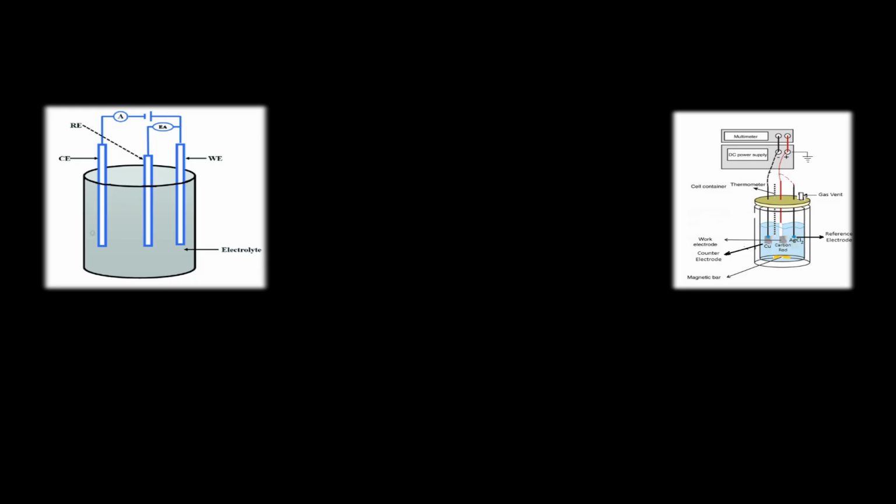However, graphite is non-reactive but will have an electrical resistive property to it, where the manufactured electrodes such as the calomel, the silver chloride, and the standard hydrogen reference electrodes will have a fixed voltage characteristic to them. For a graphite electrode, some experimentation will be required.